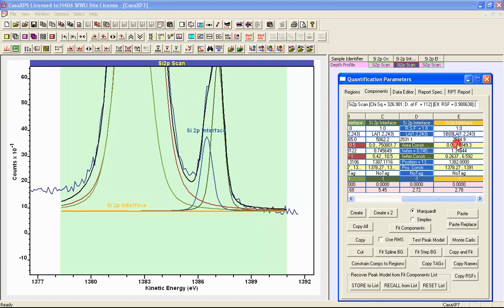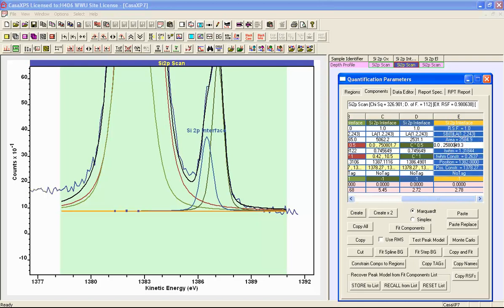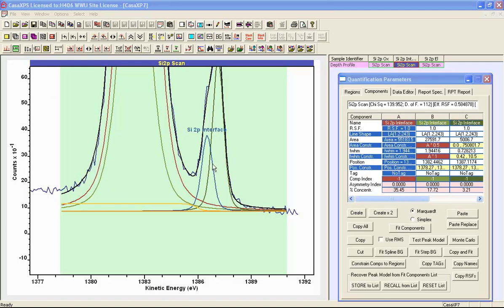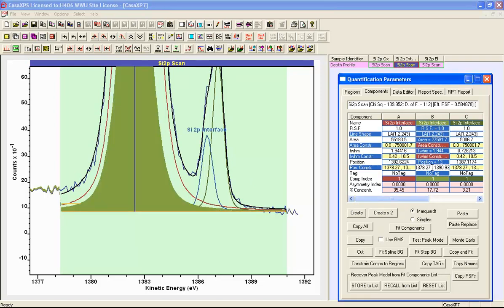Let me just give it a little bit more room in terms of area, because backgrounds are relatively intense items, and if I say fit here, I end up with a step now that is occurring at a point just after the elemental peaks. The offset between these elemental peaks should be reproduced to some extent between these oxide peaks. Let's just investigate the offsets.